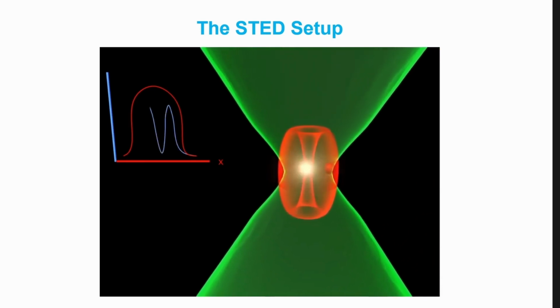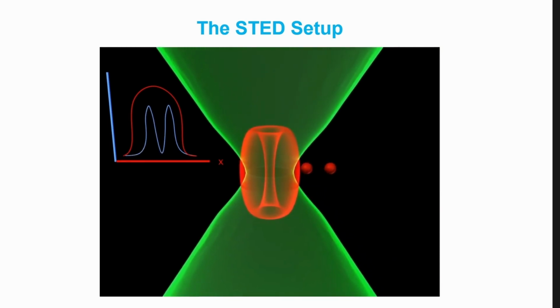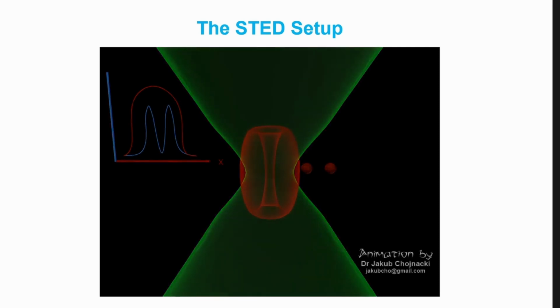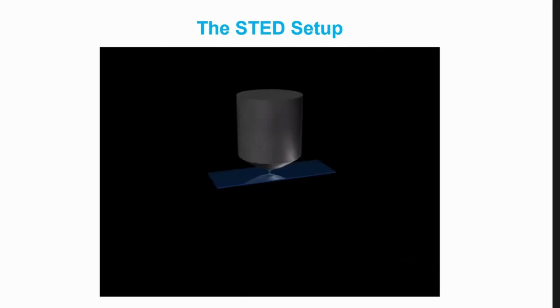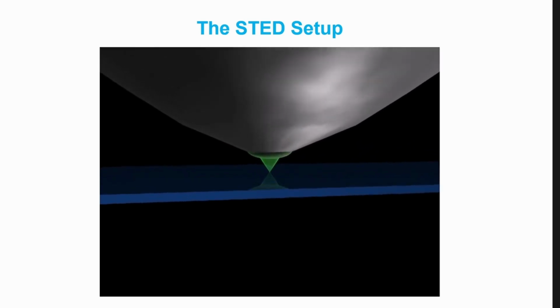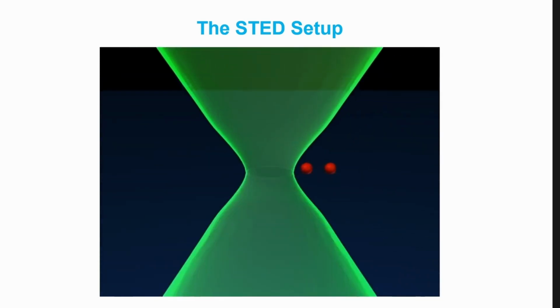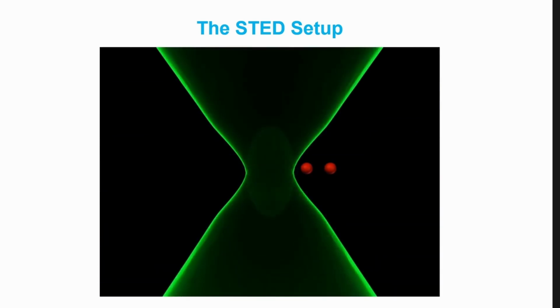And like I also mentioned, typically when you get images from a confocal STED microscope, you get a combination of confocal images and STED images of the same area, so that you can use the confocal image to know where you are and see a complete image. And then you use the STED channels to resolve details which you cannot see with the confocal resolution.